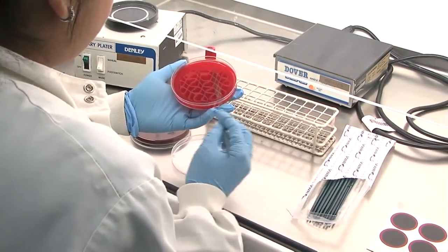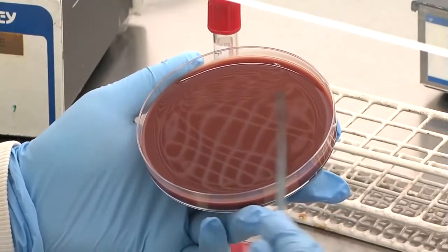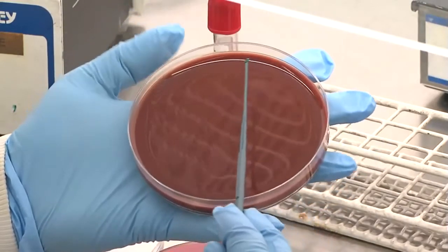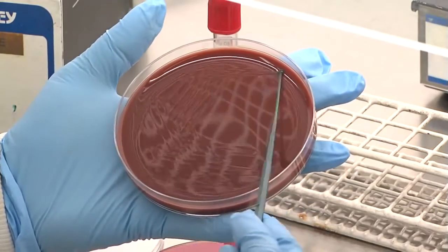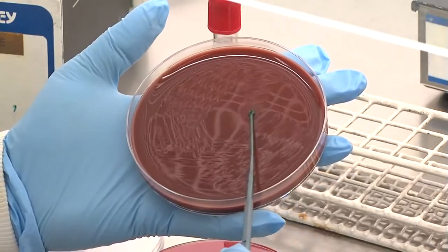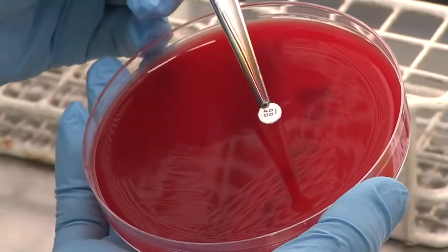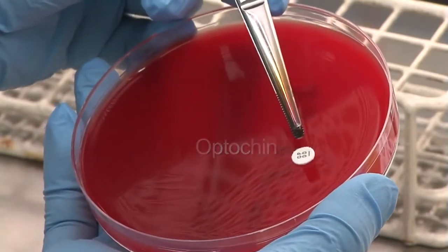Culture of the blood is made onto agar culture media, including chocolate agar incubated at 37 in carbon dioxide and a blood agar incubating anaerobically at 37. To help with the identity of this organism, a paper disc containing a chemical called optochin is placed onto the blood agar plate.